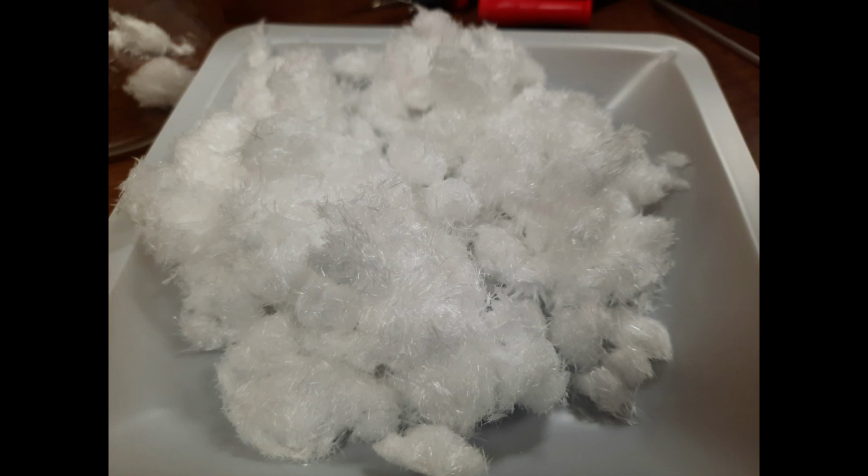Okay, let's see if this will work. So, this is for the video. This is our product. It's recrystallized nitroguanidine. I think I got about 35 grams, which is like a 75% yield. It's fine in my opinion. This process works incredibly well. But we'll see what an issue is with this synthesis.